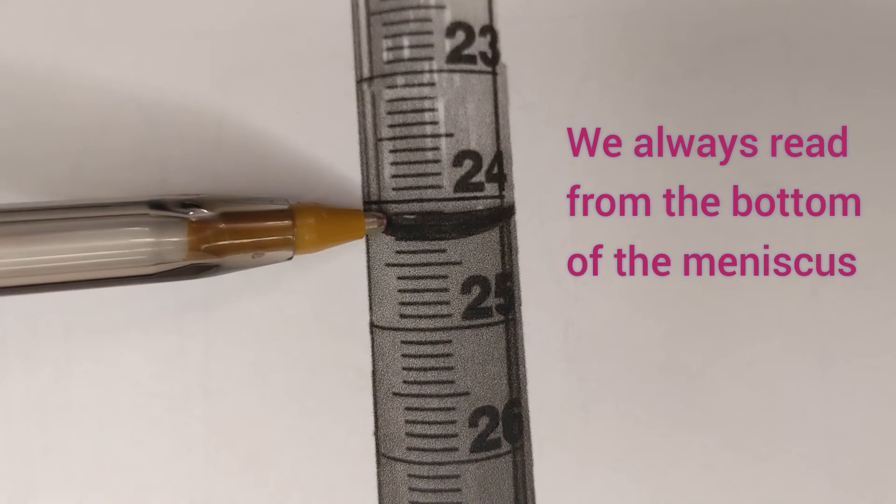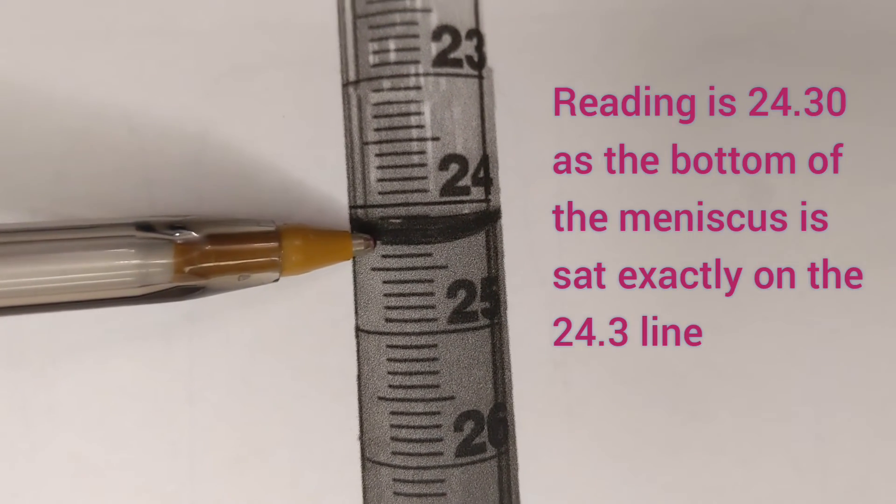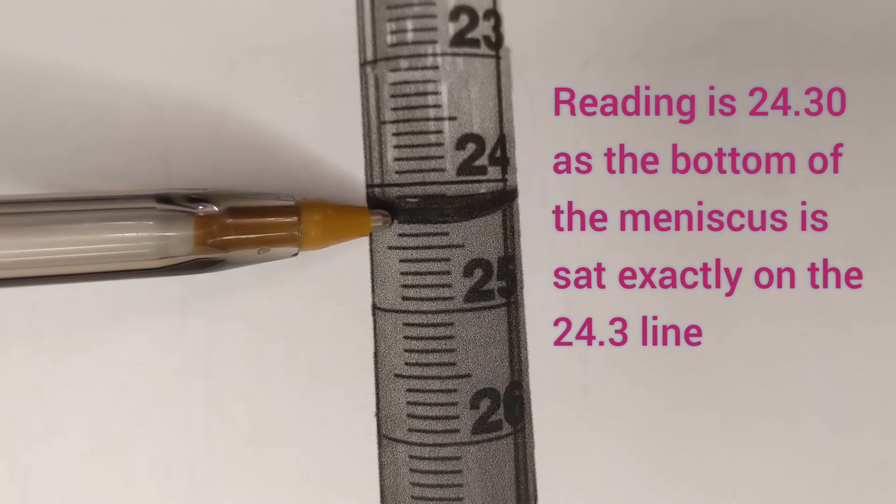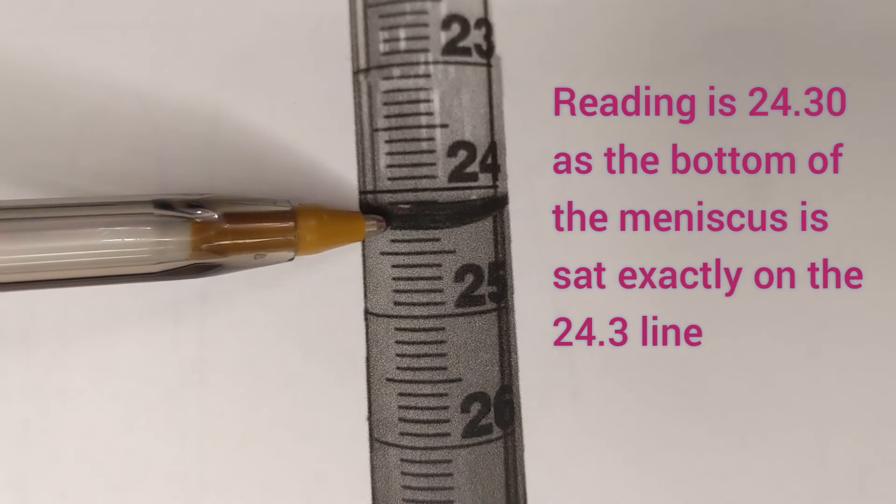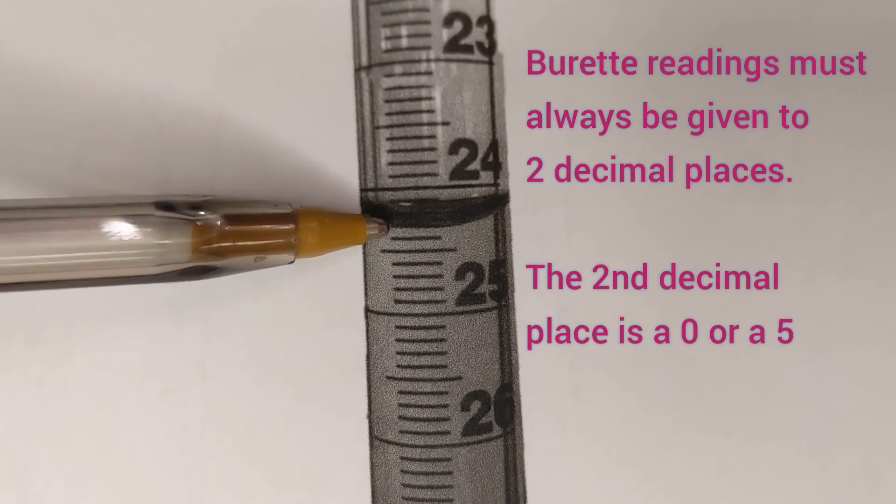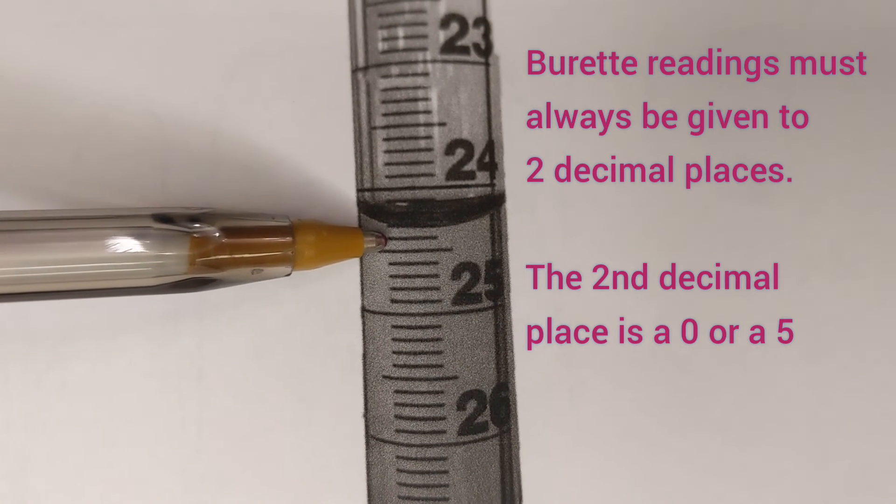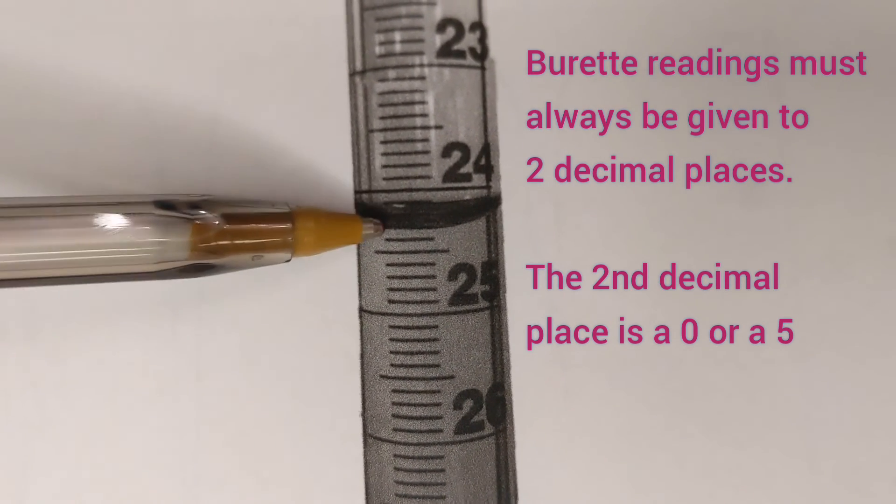So this burette reading is 24.30 because the bottom of the meniscus is sat exactly on this line which is 24.3. If it was in between 24.3 and 24.4 then it would be 24.35 but it's not, it's exactly on the line.